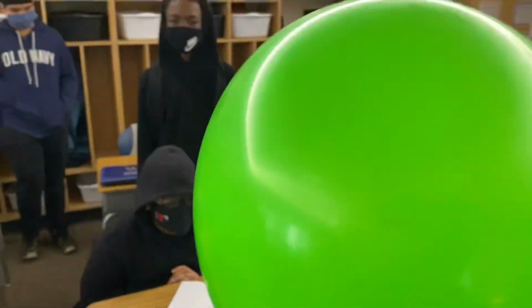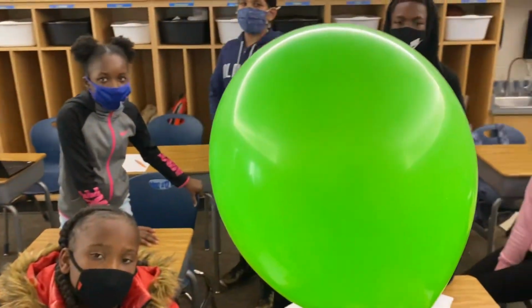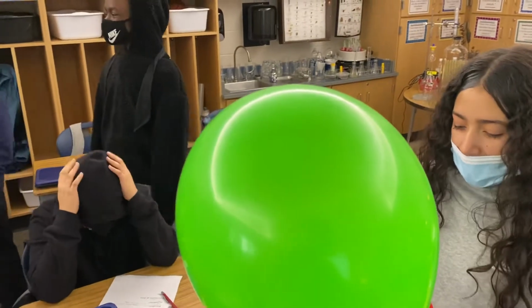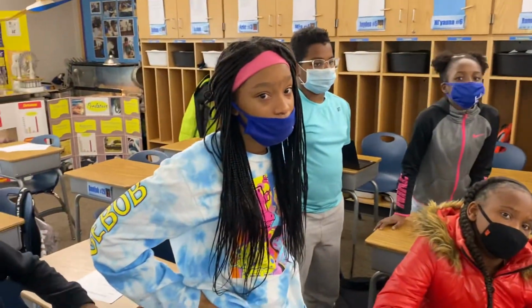All of the carbon dioxide in the balloon was condensed, and you saw it in the flask. Did the balloon really inflate itself, or did the carbon dioxide simply expand? Carbon dioxide simply expanded. It expanded back into a gas. 6th graders sublimating CO2 with liquid nitrogen. Pretty cool.